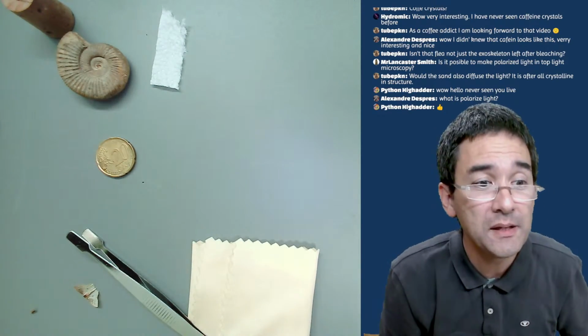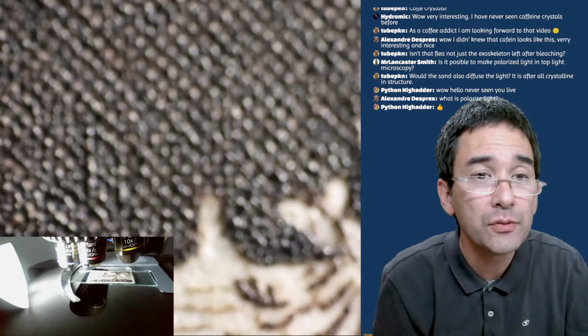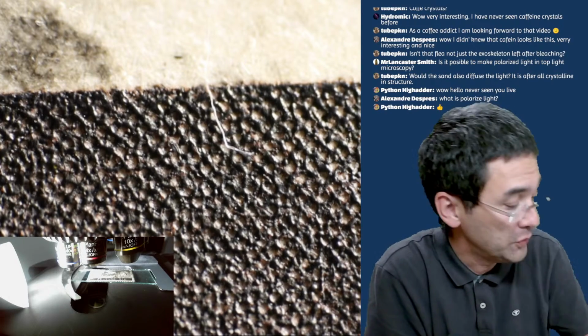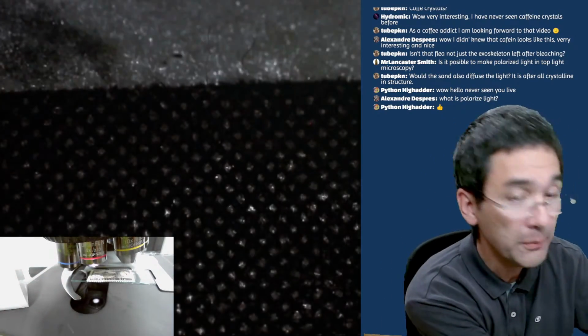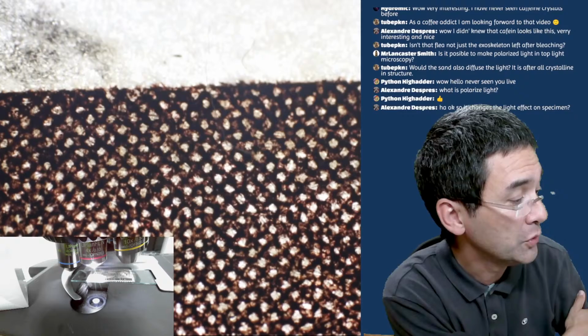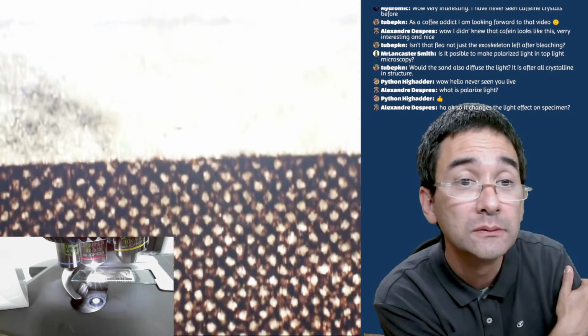So this was basically the stamp under the microscope. You see the print here. Again, opaque objects. When I turn on the light from the bottom, it will look quite different here, much flatter. But here I have to turn it up quite a bit because now light is able to go through the paper.